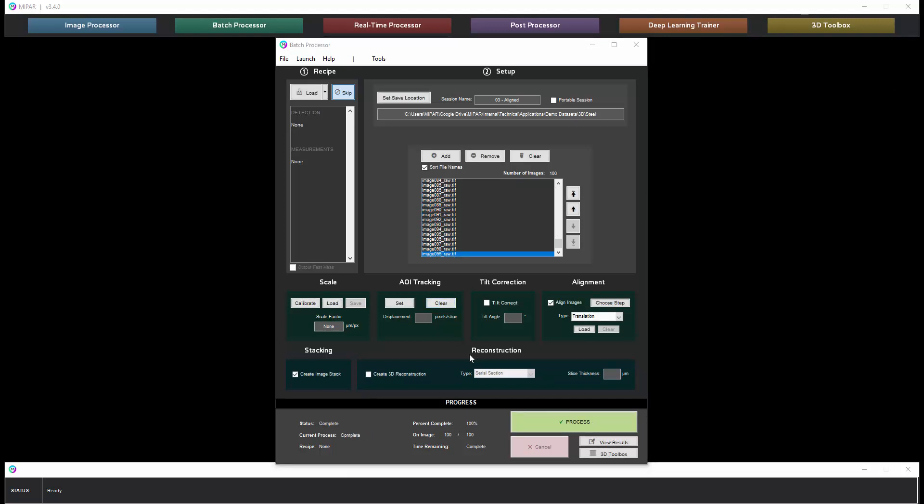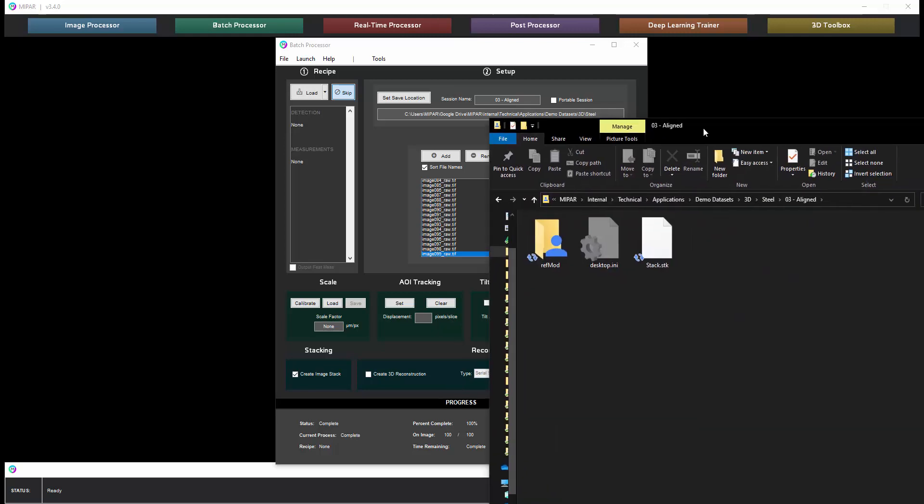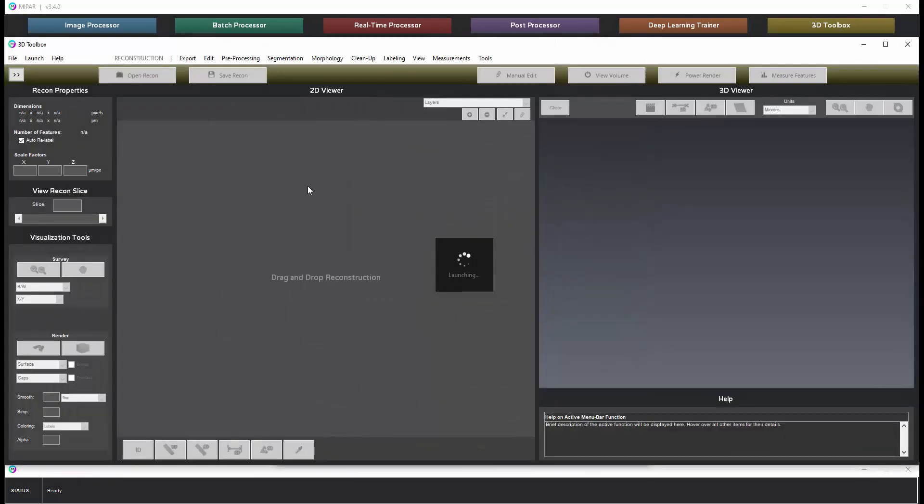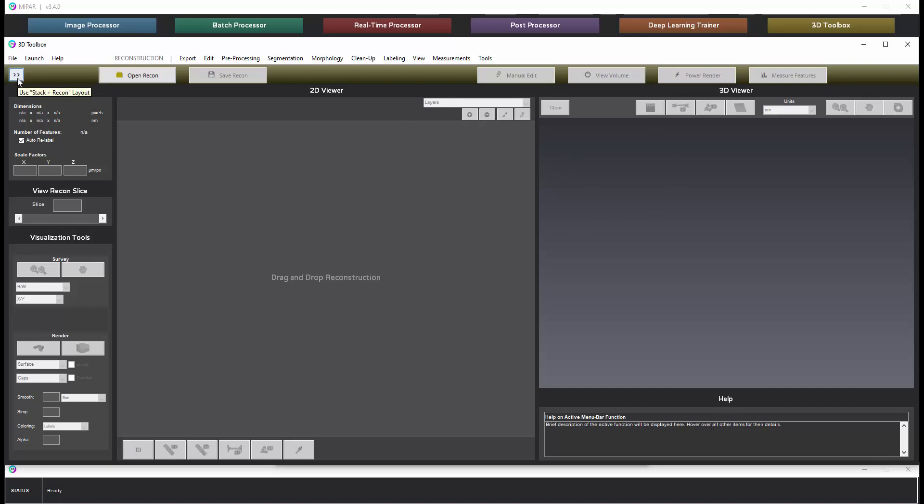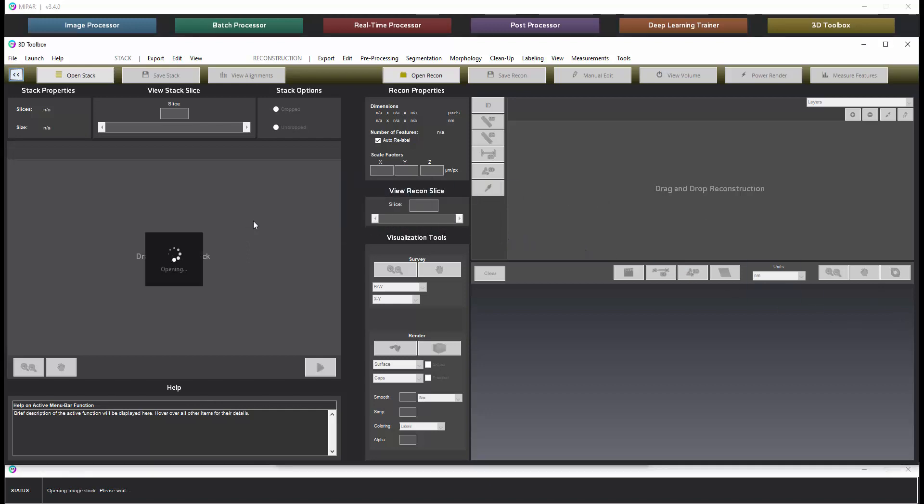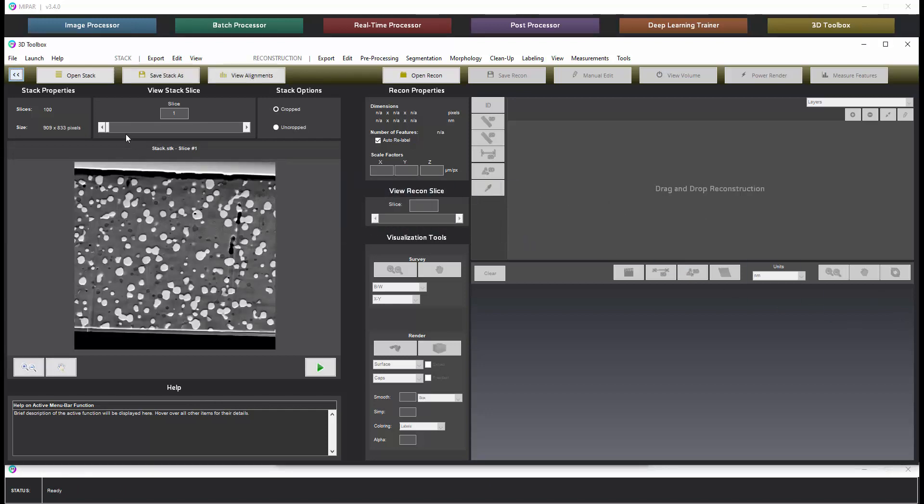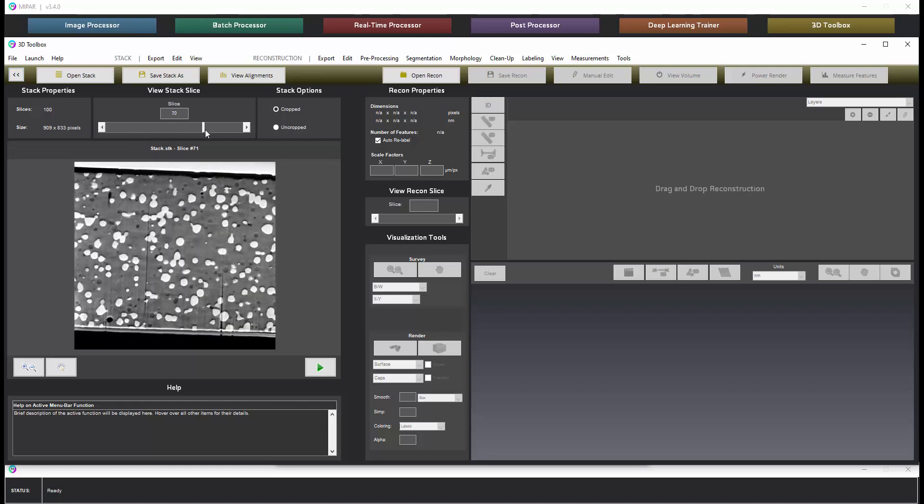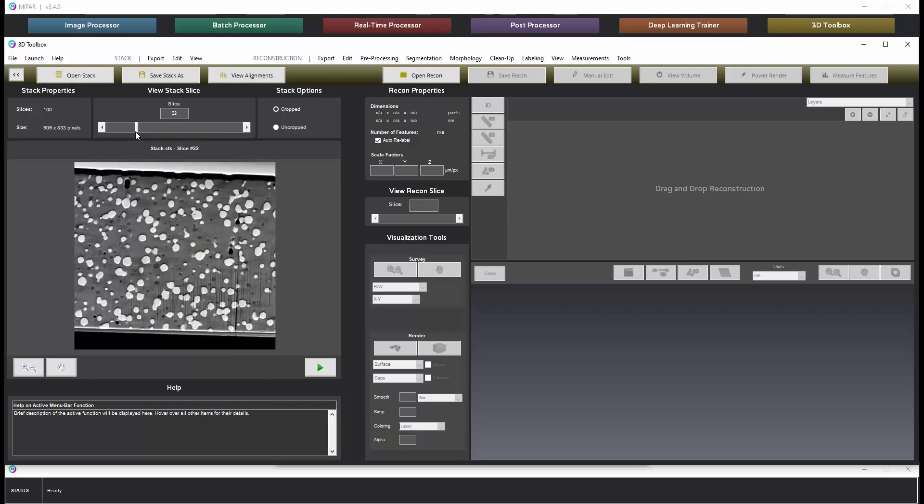Once the batch is complete we have our image stack file in the output folder. So we're going to open this up in the 3D toolbox. Now when you open the 3D toolbox you'll see this layout. If we click this button this will expose the image stack controls. We can then drag in that image stack file and we can then slide through to verify that the alignment worked.